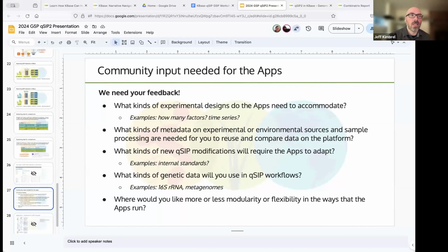Yeah, I would love to chat with you. We have some methods to try to determine what that shift in density might need to be. Going forward, we're starting to see more, and this is what JGI has really standardized if you do qSIP through them, the introduction of actual spike-in standards. So this is a known GC content. We know what density it should come to. So then you can more empirically shift your densities later. But yeah, like I said, we have some methods that we've used in the past.